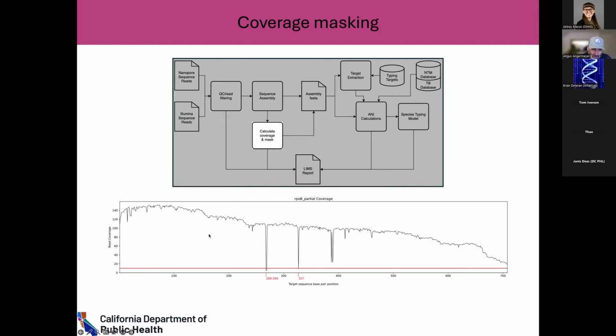This is obviously an extreme example, where you can very clearly see that 3 base pairs dipping below the 10x coverage aren't going to affect the overall analysis. But what happens when 1%, 5%, or 10% of the base pairs drop below your coverage levels? Then you're obviously going to have to decide at what point it gets cut off, and that's what the ANI thresholds will do.